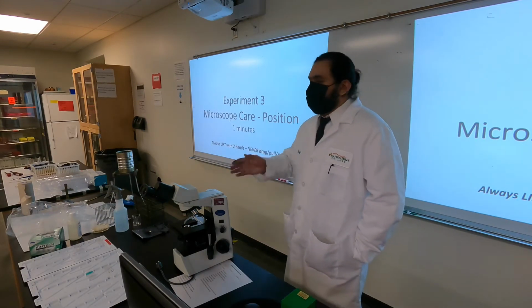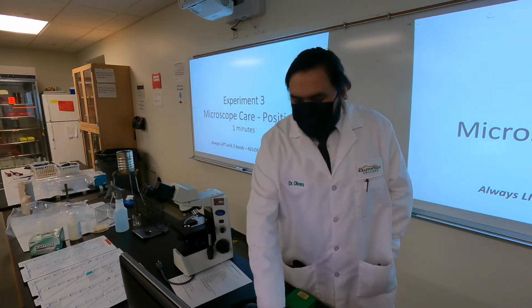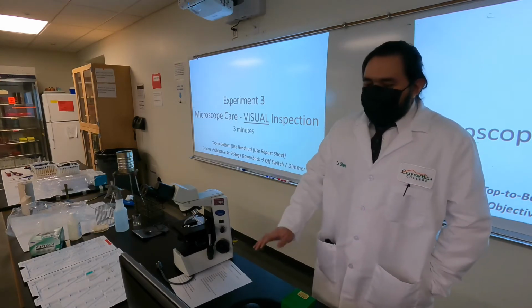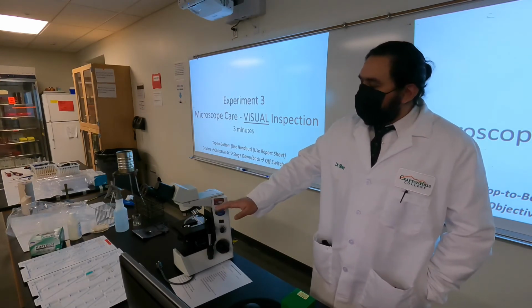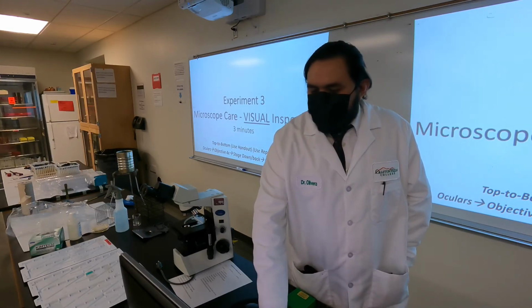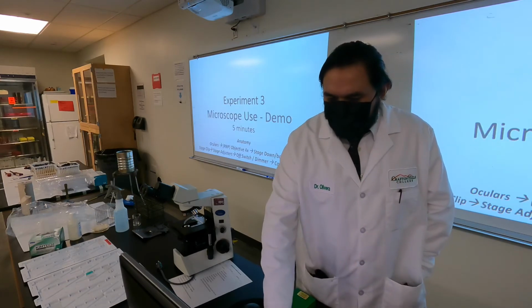Then we position it to a place where you're going to be comfortable, close enough whether you're standing or sitting, right? And then we did the inspection from top to bottom, making sure again oculars, stage, objectives, and everything else is done, right? And then now we want to make sure we have the correct use behind it, so we're going to demo it.